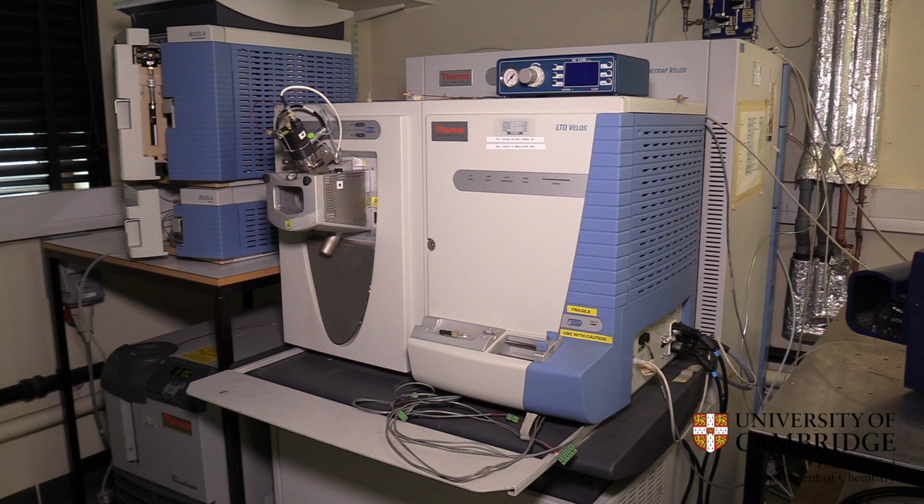So we are interested to know what's the toxicity of the aerosol particles that are suspended in the air in urban environments or volcanic regions. And to measure the toxicity of these particles, we dissolve them in a solution that simulates the lung fluid. And then with this instrument we can see if the antioxidants that are normally present in the lung get depleted. This type of mechanism is very important for health studies because particles can cause what is called oxidative stress.